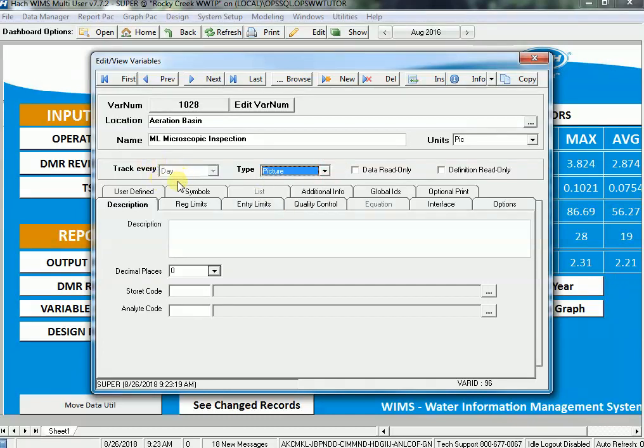That is because only daily pictures can be tracked. This is to protect the database in case somebody wanted to set up a minutely picture. The size of the pictures would potentially fill up a database very quickly, so at this time we only support daily type pictures.